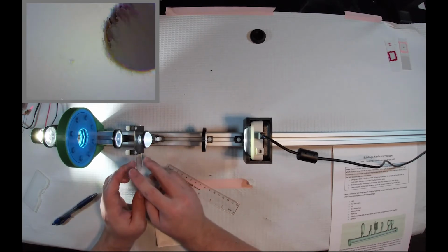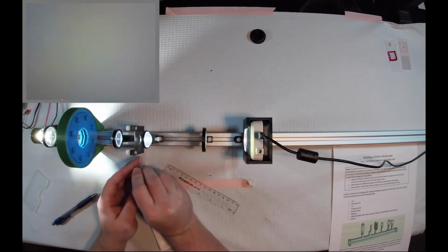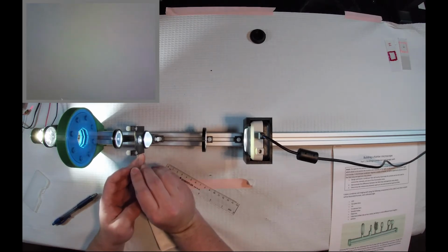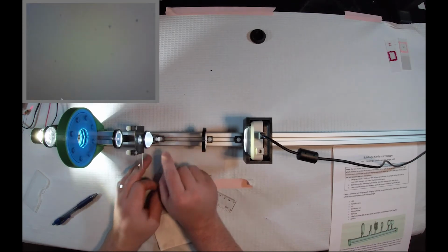Make sure that this is on the right side. Actually, no, it's not. We need to get this a little bit closer to our objective. I had flipped this around. We want the dot to be as close to our objective as possible because that's sort of where I measured my focal plane from. Yeah, and we'll back up a bit.